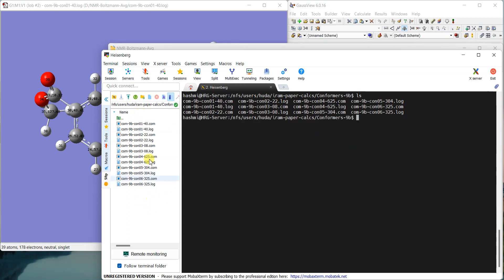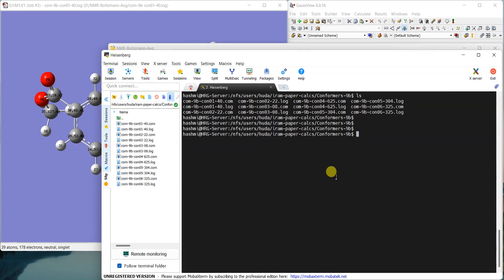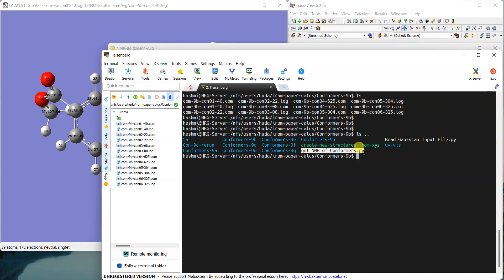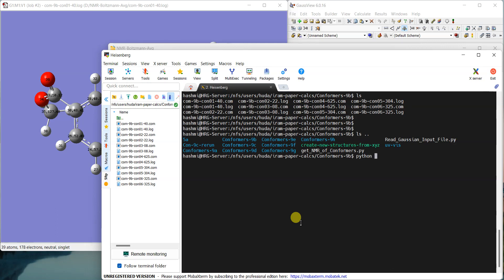I do have access to a Linux machine where I'll be using this script. So here are all those similar files which are lying on my Linux machine. You can see that I have all the log files, and the script is—if I just do ls double dot, you can see that the script is here one directory up. So I'll just use it from there. Calling the script is very simple. Just write down python3, space, and then you give the name of the script.